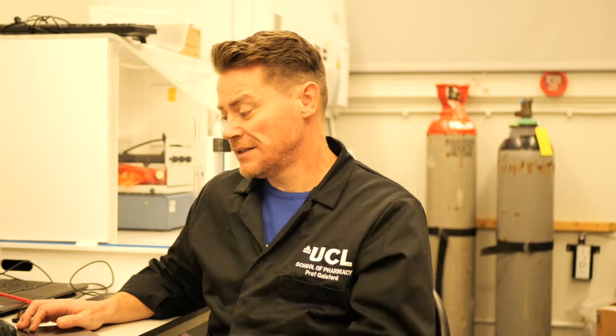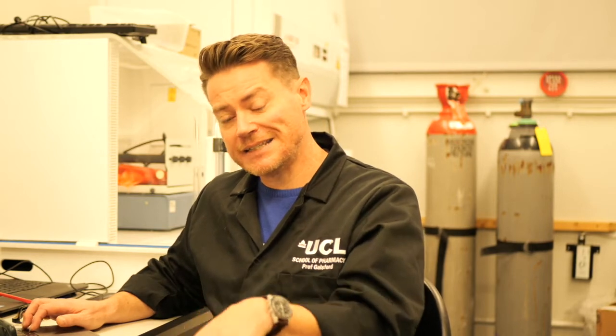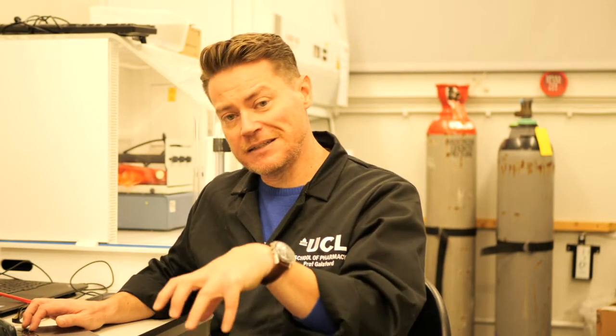So you are seeing a light source, but the light source is coming from the electrons. So you're not looking at the electrons directly, the electrons are hitting the screen and being converted to light, and then you're looking at the light source. And I suspect that with more modern TEMs, the electrons hit a CCD array, and that image is transferred directly to a computer, and then you're looking at it through the computer.